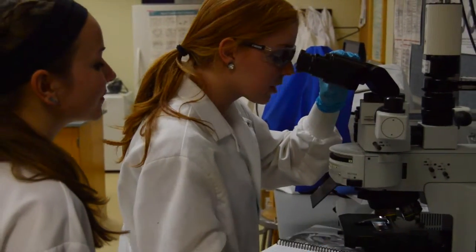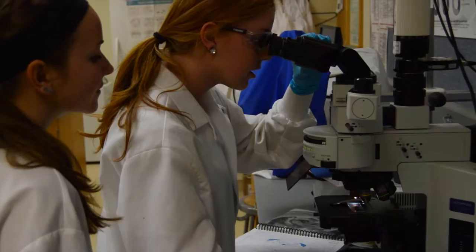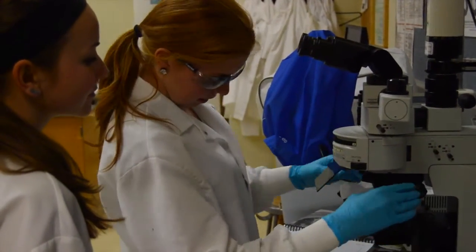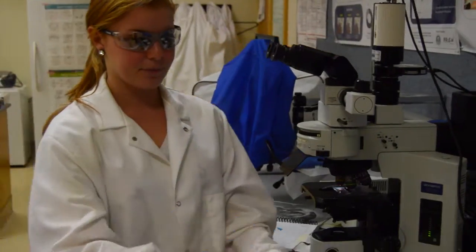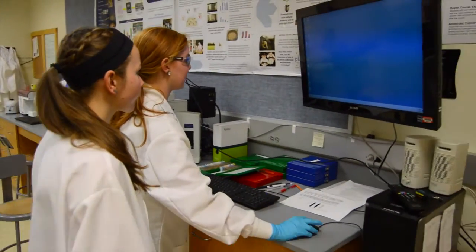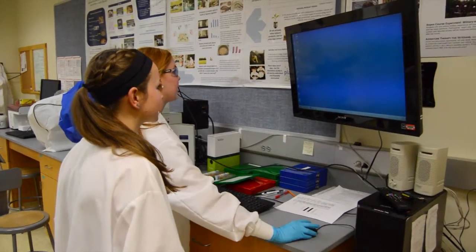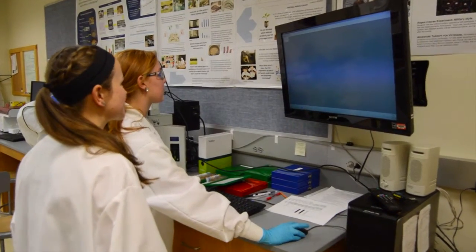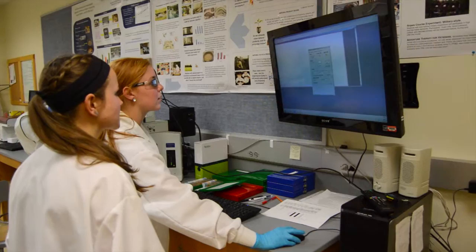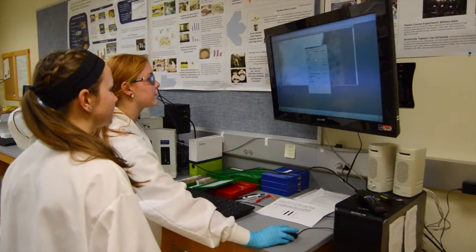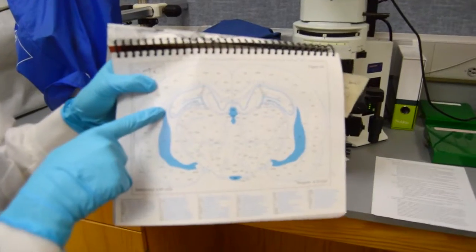The next step in counting neurons is neuroquantification, which uses computer software to output neuron counting and neuron size. Now that the slides are ready to be analyzed, set up the microscope, camera, and computer to start recording the data. Here, Q Capture, Paint, and ImageJ software are used to count the number and size of neurons in a specified brain region determined by the research instructor.